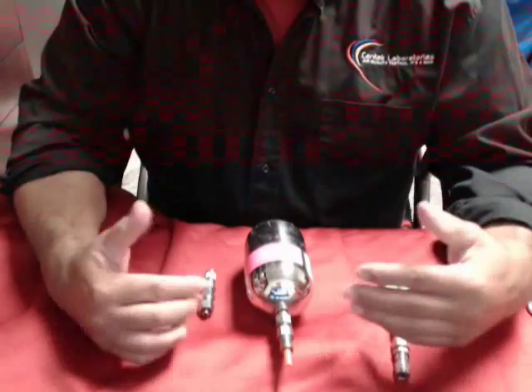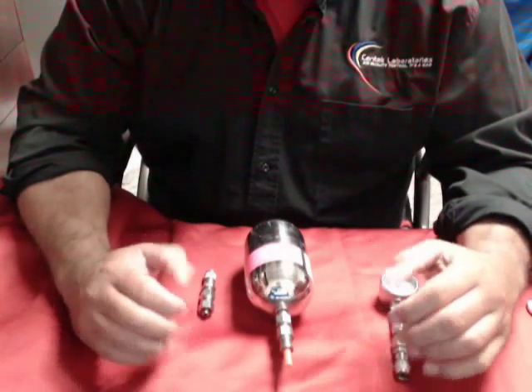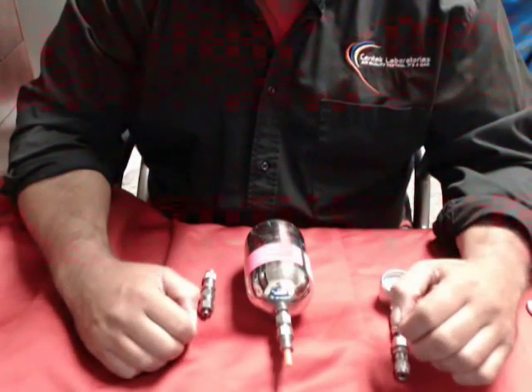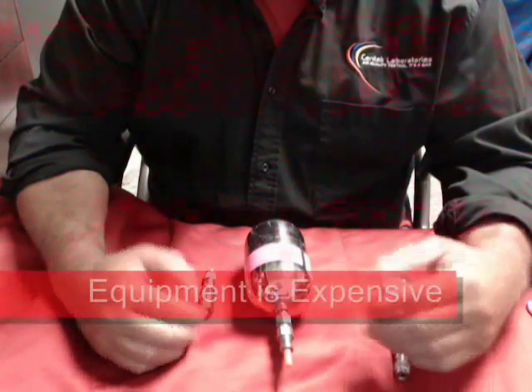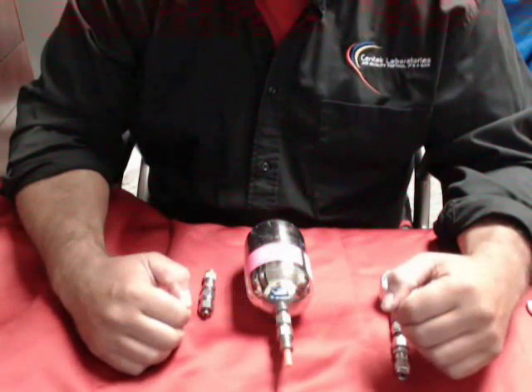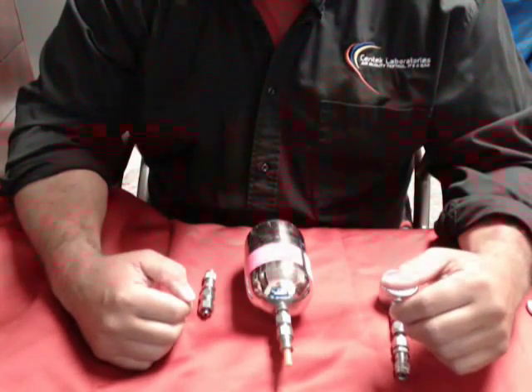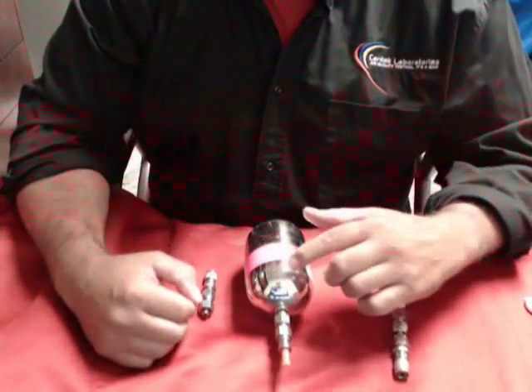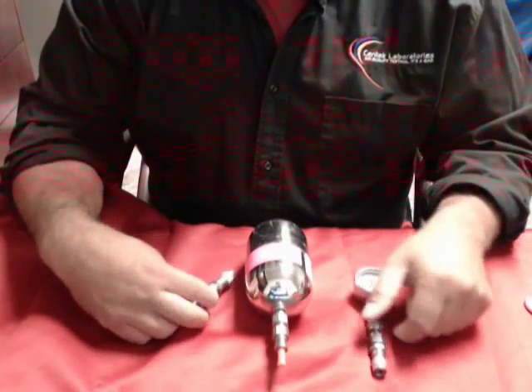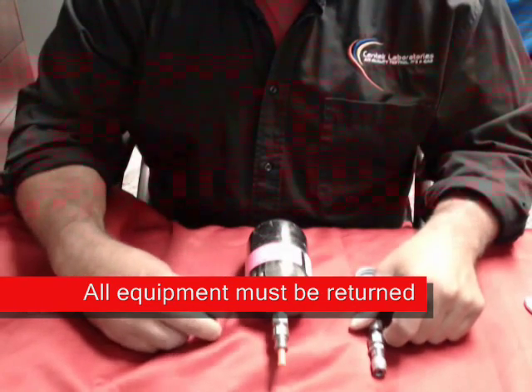Before we start this video on sampling with the canister, one major part that we really want to emphasize is that the equipment you're getting is worth several hundreds of dollars and we usually send you three to five pieces. With every piece of equipment that we send you — the canister, the regulators, and the quick grabs — they need to come back to the laboratory.